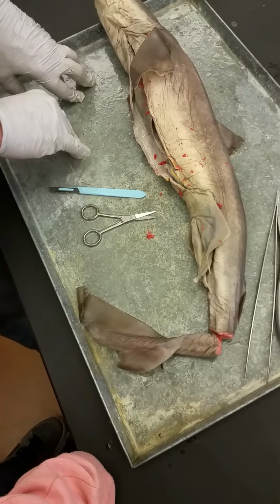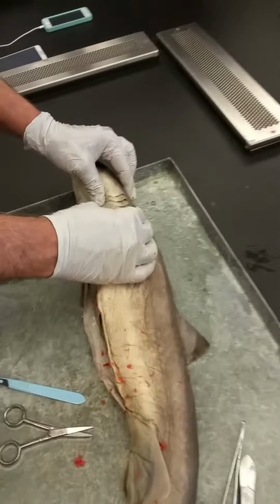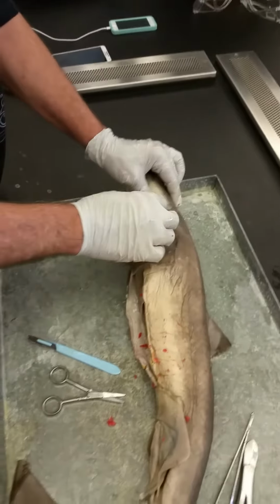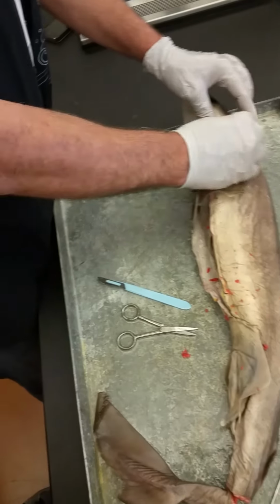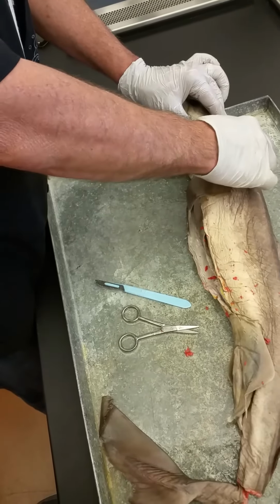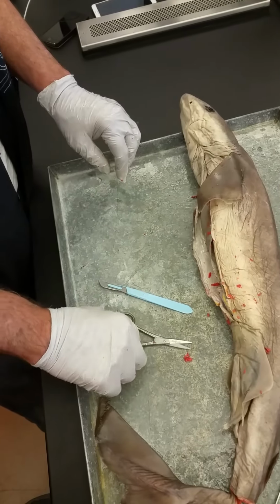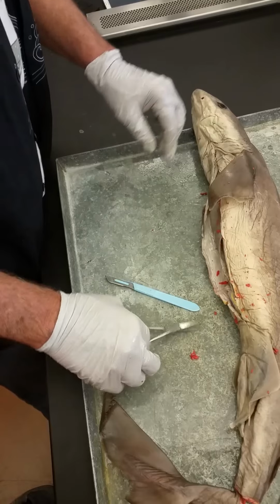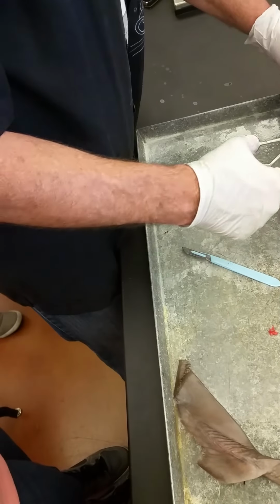Why their gills are so small? Are the gill slits small? Yeah. I guess to focus the water flow more tightly. But you're right. If you look at a white shark, they're much bigger. A basking shark, they're huge. Compared to the bony fishes, where almost the whole head is gills.